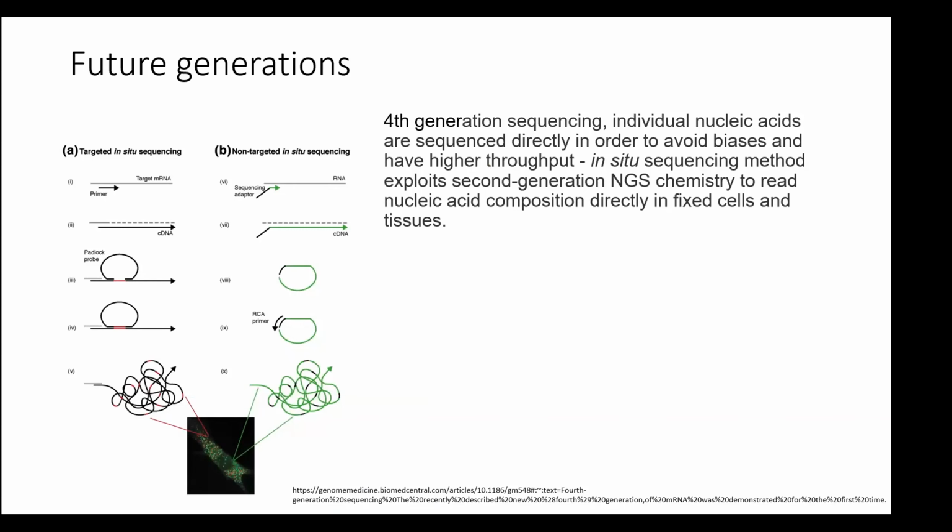Now, about the future generations of sequencing. Actually, it's a method that is already used. Maybe in the future we will switch more to this fourth generation method, which basically offers us sequencing in situ. That basically means that we do sequencing directly in the cells and tissues.